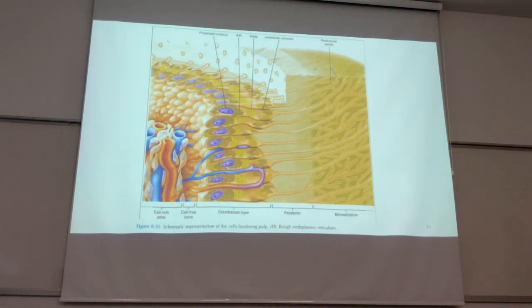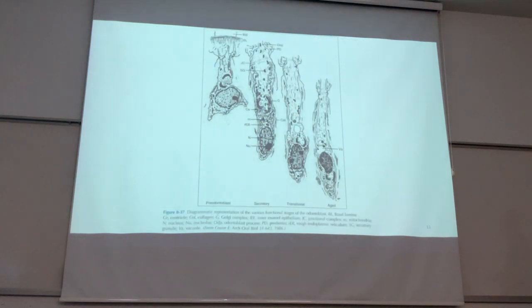Again, you can see the same thing. And now you can understand the structure of the odontoblast process. This is the odontoblastic process extended into the structure of predentin and dentin. These channels are our dentin tubules. And you can see in some areas the process forms some bridge with each other and makes this structure.